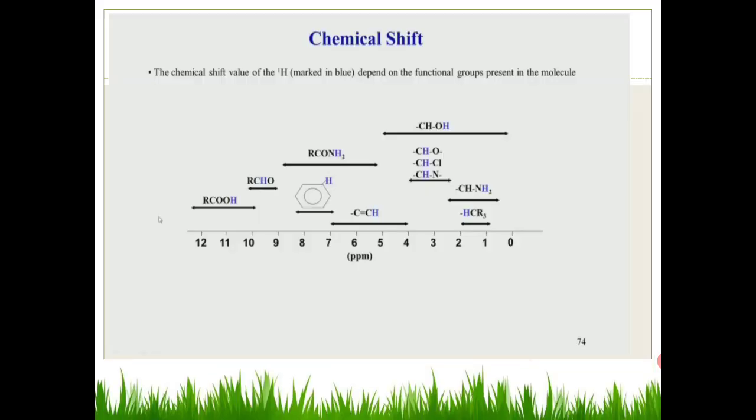So we remember that by analyzing many organic compounds, we came to a conclusion that a certain functional group appears in a certain region of chemical shift.